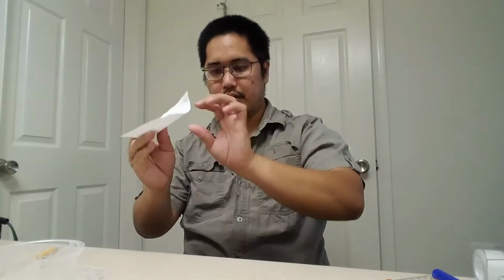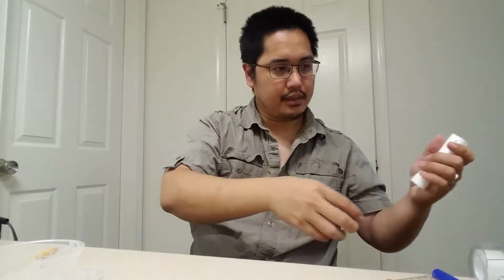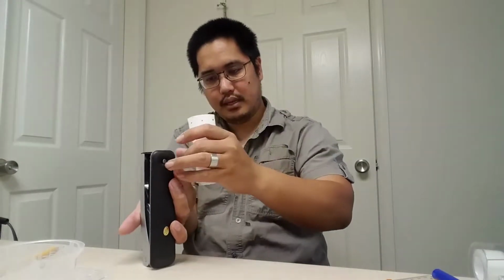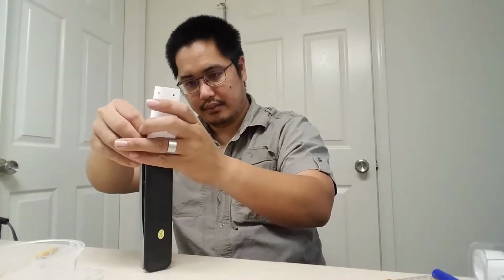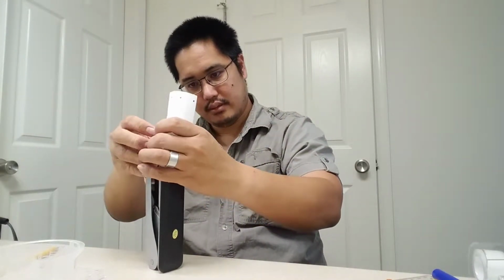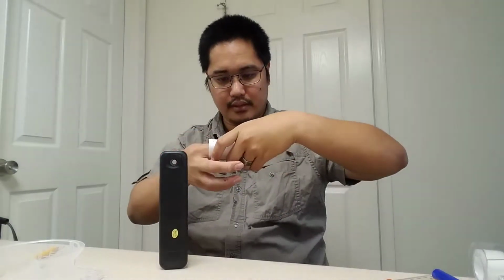And what we're going to do is we're going to take this, roll this up into a little tube, and staple it. Now, the reason why I'm stapling it is because the metal is not going to interact with the water. So, again, this isn't going to mess with my experiment. If I can even get it stapled. A second. There we go. And voila. Okay. I'll do another one over here.